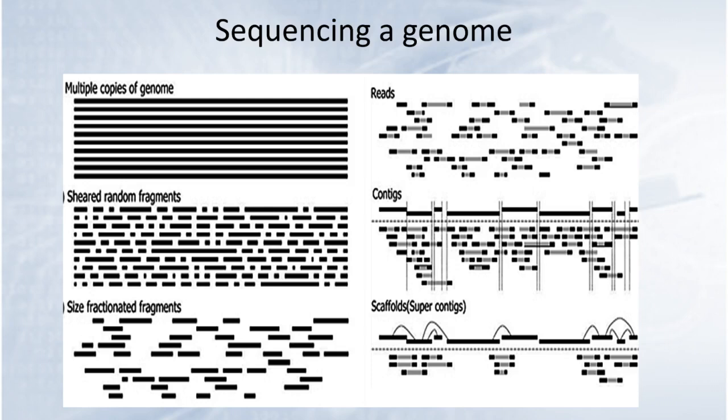And so the primary goal of reassembling these things is to generate what are called contigs. And so the reads, in this case, that you are provided are in the format of FASTQ sequences. And they're paired, so you have a set of read one FASTQ sequences, and then there's an essentially matching set that are R2s.